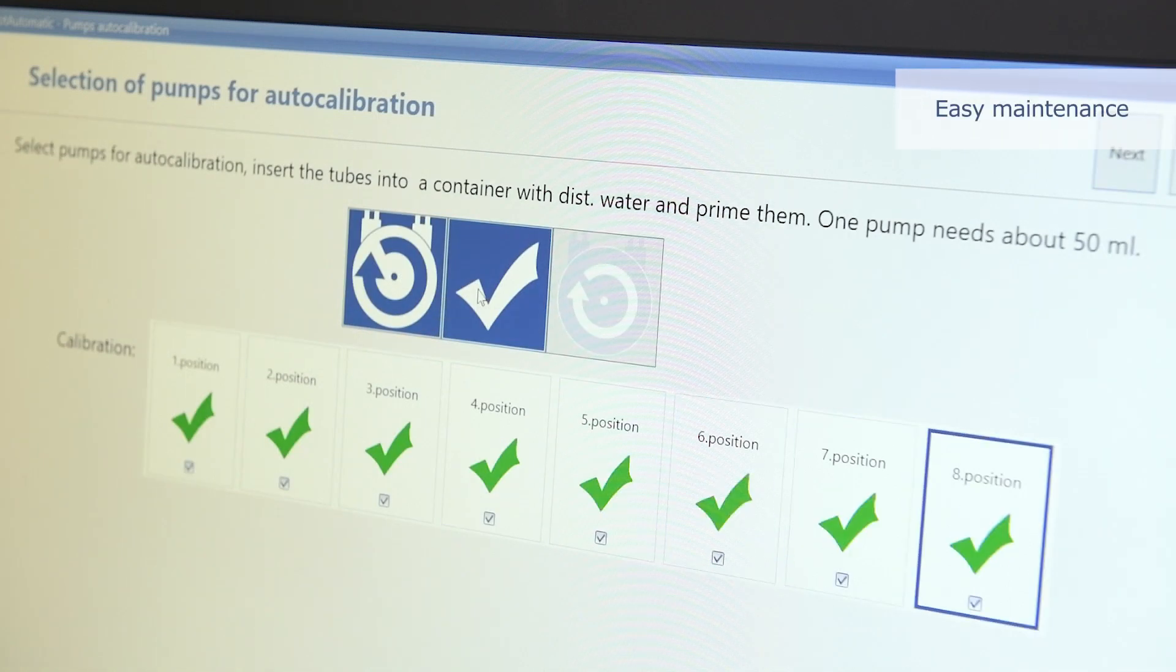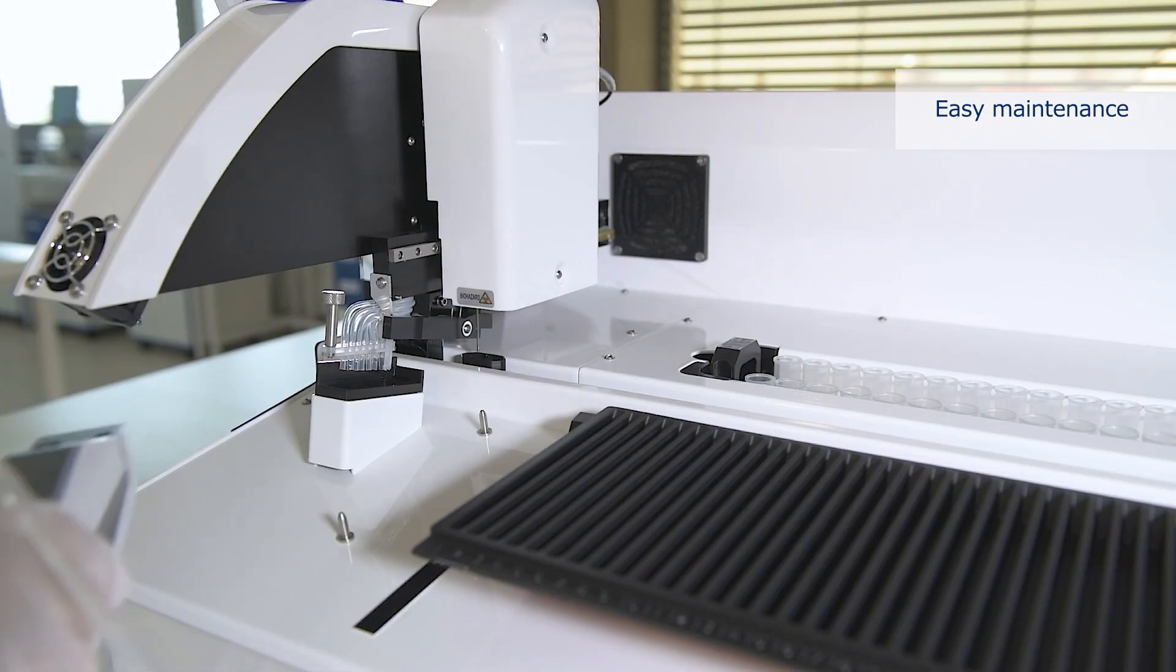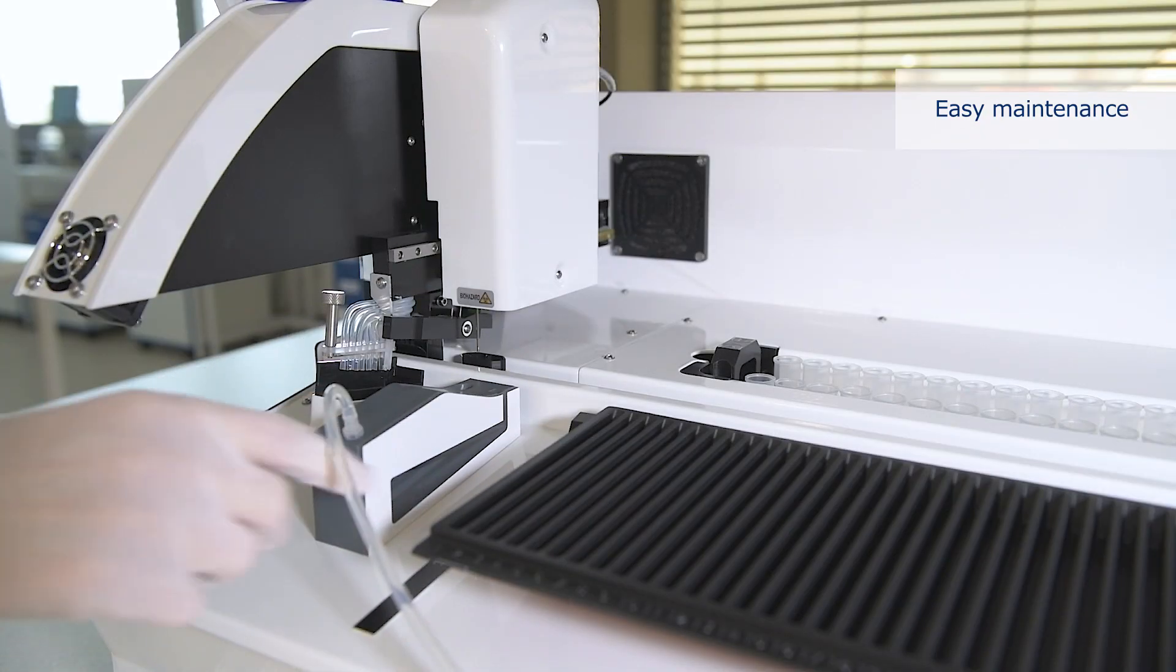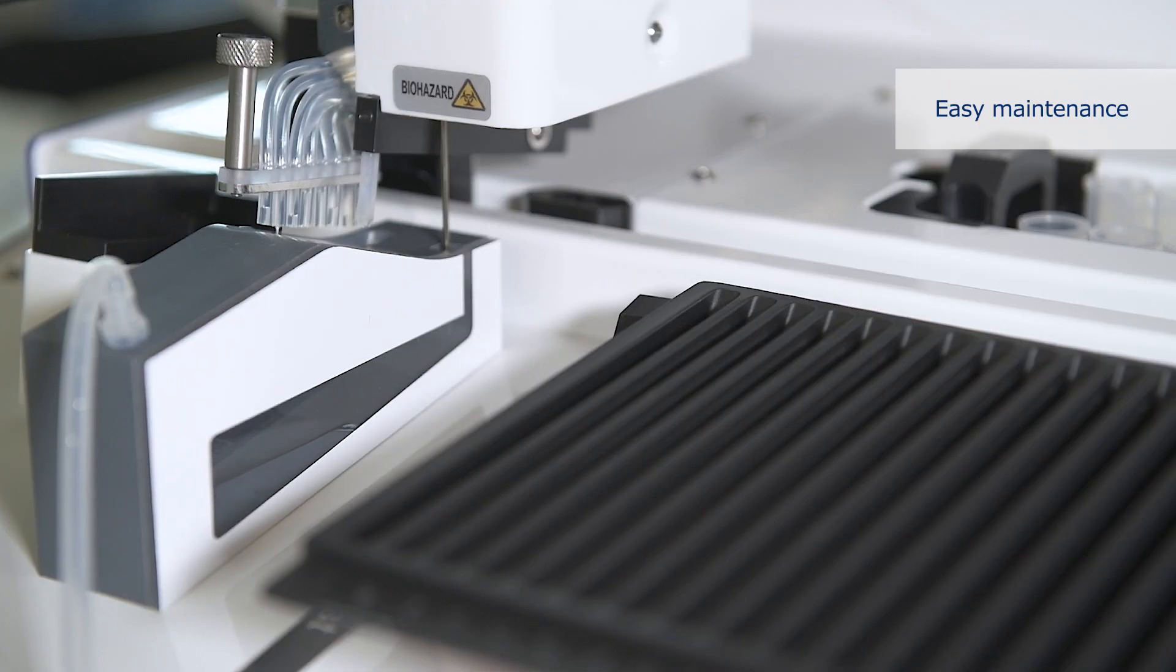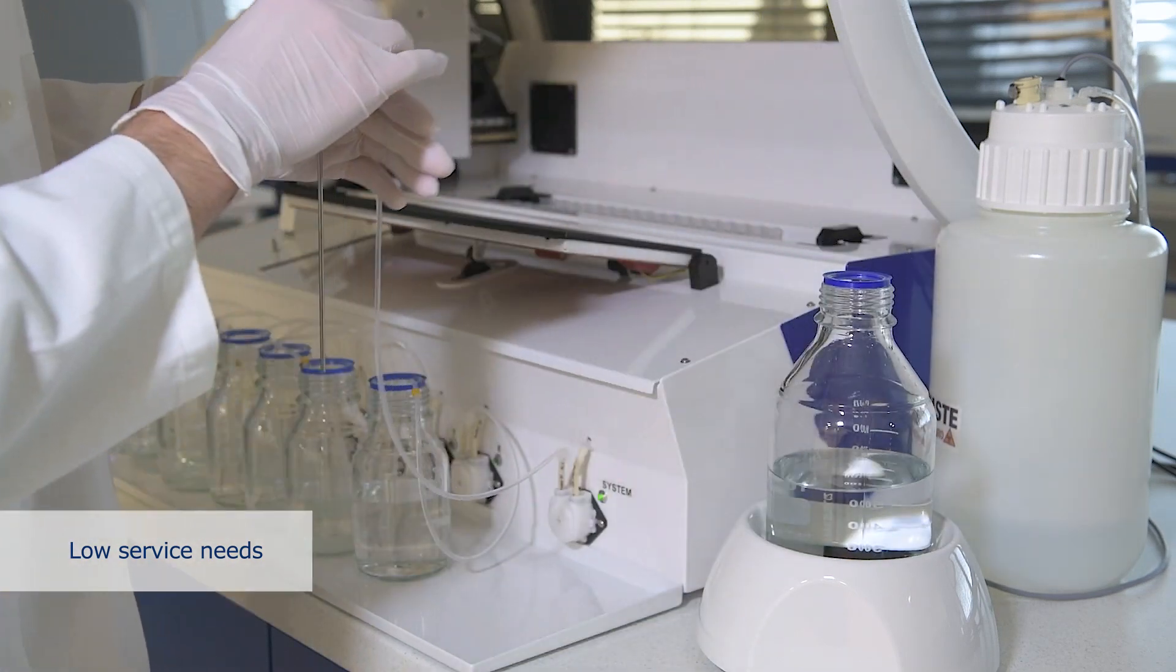Maintenance of the device is extremely easy. Apart from simple rinsing and monthly auto calibration of the reagent pumps, only a simple annual preventive procedure is necessary. The instrument is very reliable and doesn't actually need much servicing.